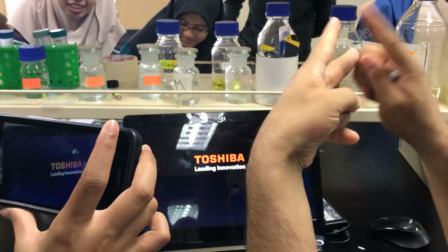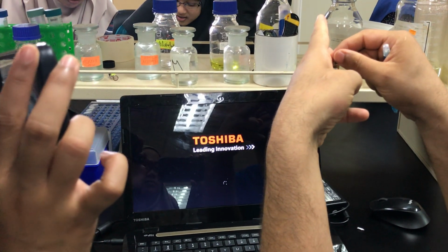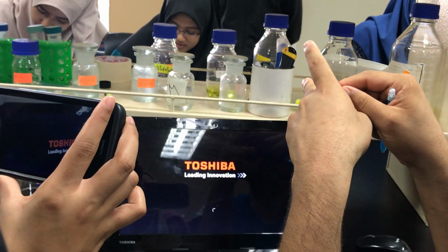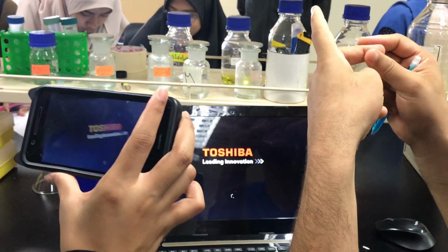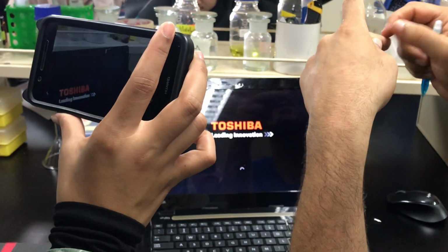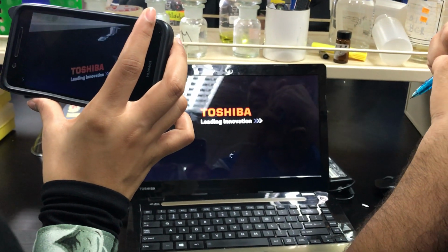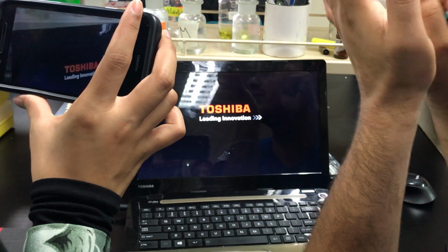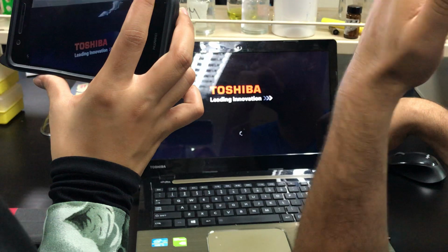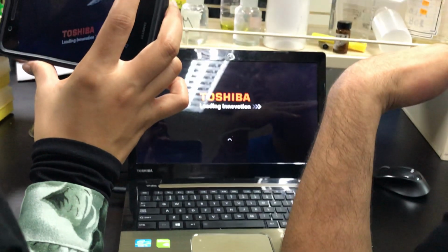Okay, because this is positive and negative. For positive should be less than 0.3. Less than 0.3 for positive. For negative should be more than 0.5. Yeah, meaning 0.1, 0.2, 0.4. Okay, not less than, more than or less than 0.3, 0.5, more than 0.5.